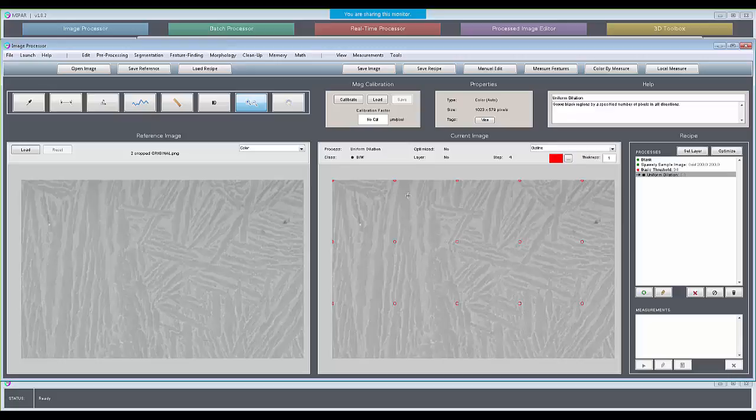So to point count a segmentation is sort of to force yourself to use, say, a plastic ruler to measure your image instead of a caliper. You could use all of the pixels in your image, and when you repeat that over multiple images, you now have 5 caliper measurements instead of 5 plastic ruler measurements. The uncertainty of your measurements is really going to come from how many cross sections you've captured.